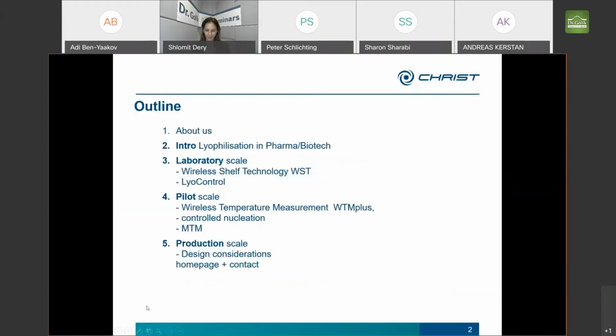A short agenda. First I want to show you a little bit more about who Martin Christ is, who the company is, then lyophilization, some basics, a short introduction. Then I will start with the lab freeze dryers, some accessories for the lab freeze dryers, the next steps, pilot freeze dryers, and then we take a short look at production and how it looks in pharmaceutical industries.